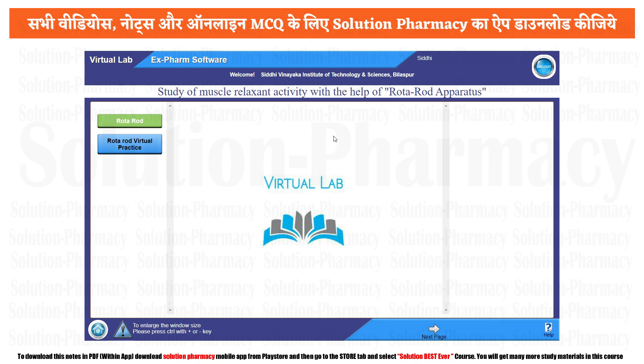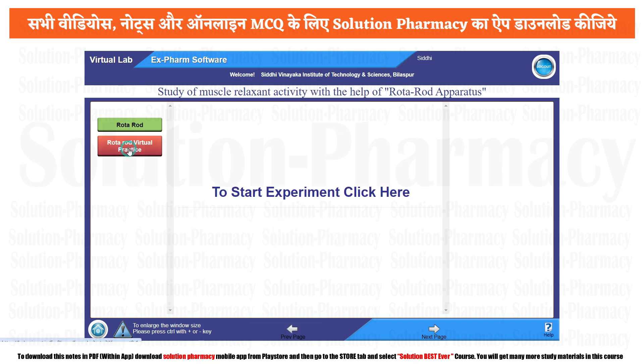The same principle can be applied to assess anti-anxiety activity of a given drug — this is a one experiment with dual use, like a buy one get one free offer. So let's start the practical by clicking on the procedure: Rotarod virtual practice.